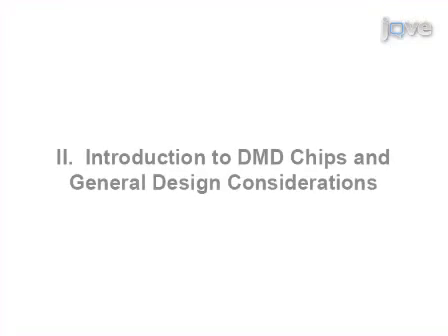Today we will show you a procedure for generating complex patterns of illumination in an optical microscope. We use this procedure in our lab to study dendritic integration, so let's get started.